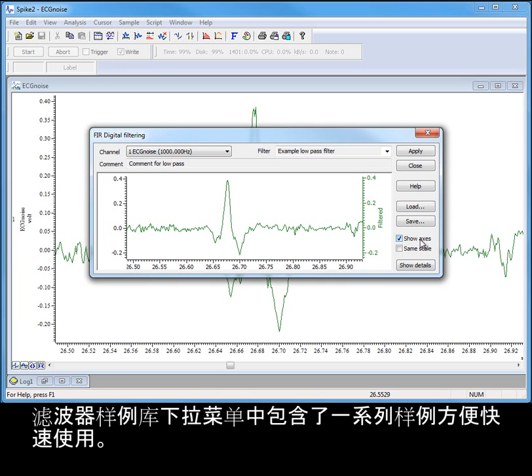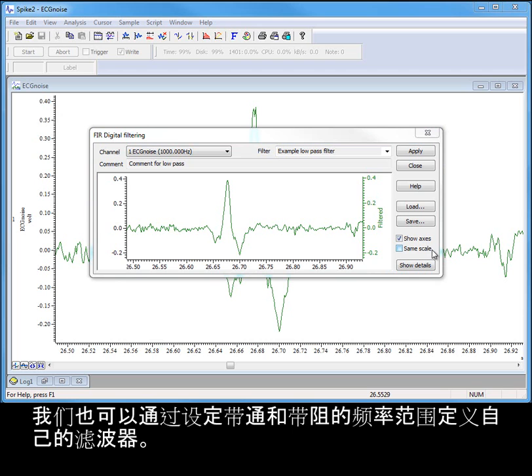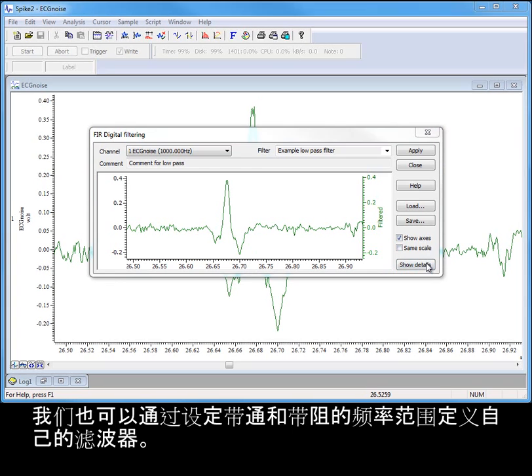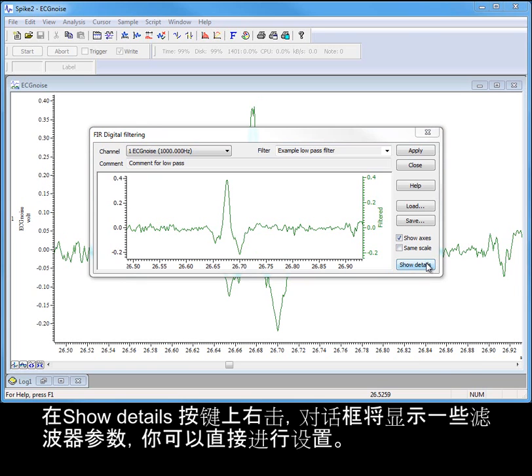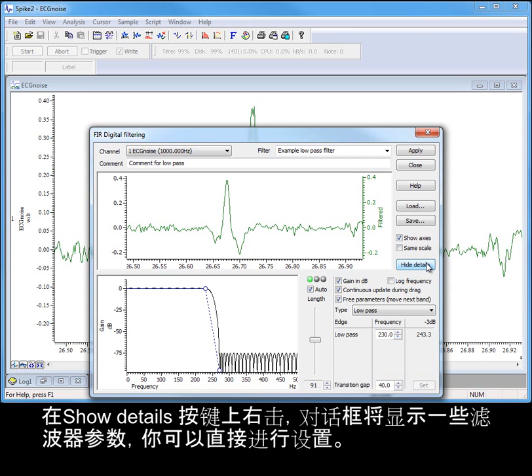The filter bank drop-down holds a list of examples for quick access, but we can also define our own filters by setting up an arrangement of bands for passing and stopping frequency ranges. Clicking on the show details button extends the dialog to show a range of filter settings that can be edited directly.